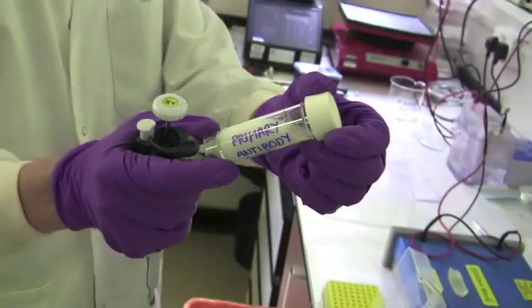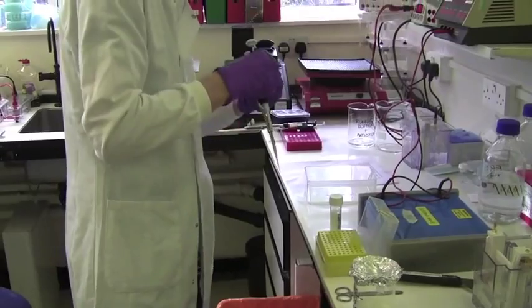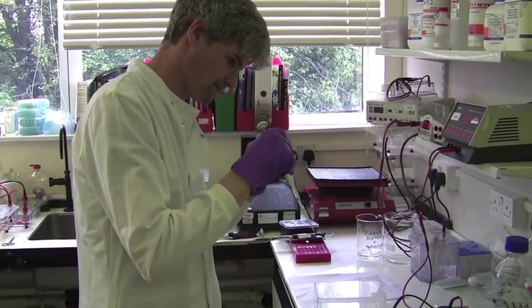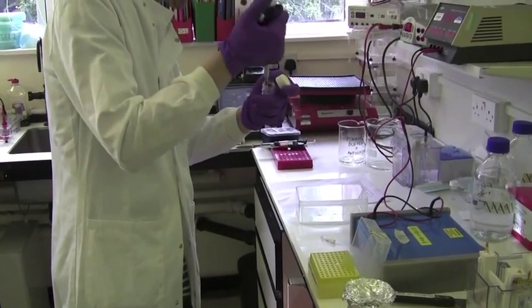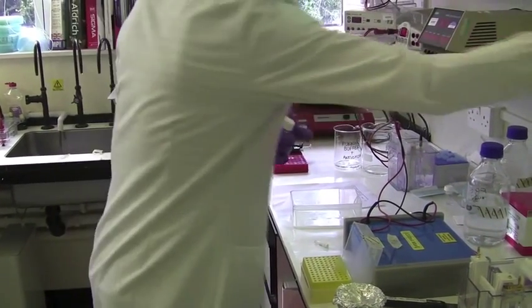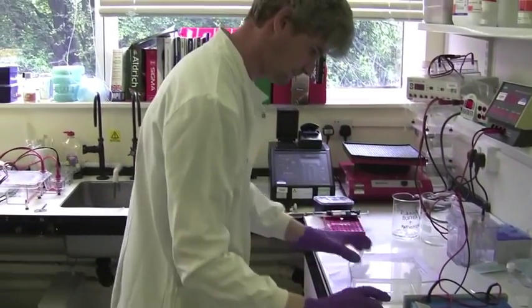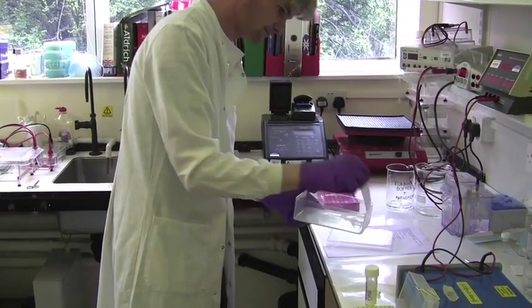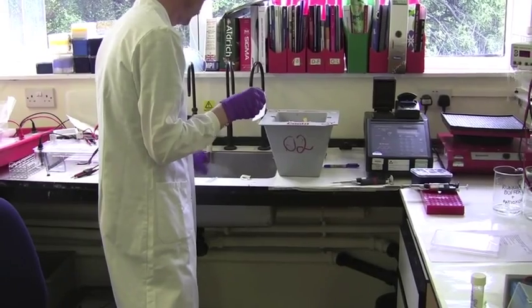Antibody is chosen which binds to a specific region of the protein of interest or a specific epitope on a group of proteins. The antibody is diluted to a recommended dilution in wash solution, which can also have detergent or blocking solution added to increase the signal-to-noise ratio. The antibody is incubated with the membrane for 2 to 16 hours, depending on the amount of protein to be detected and the affinity of the protein for its target.